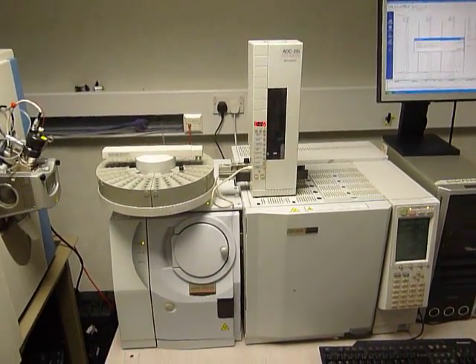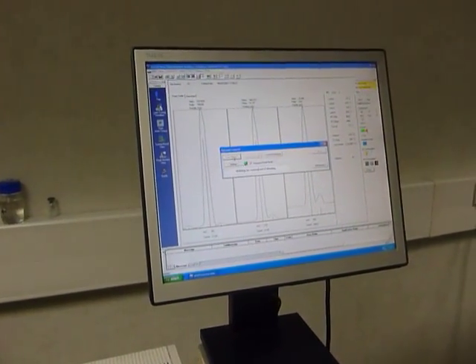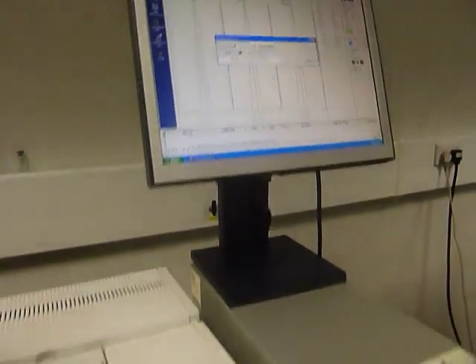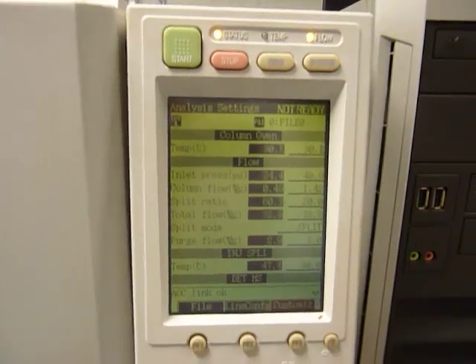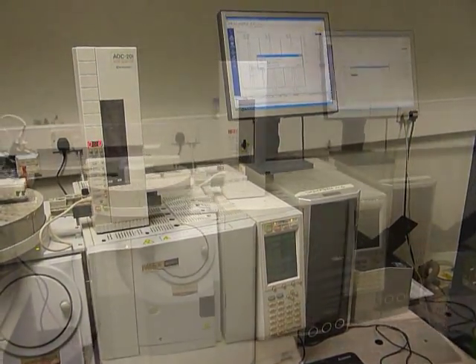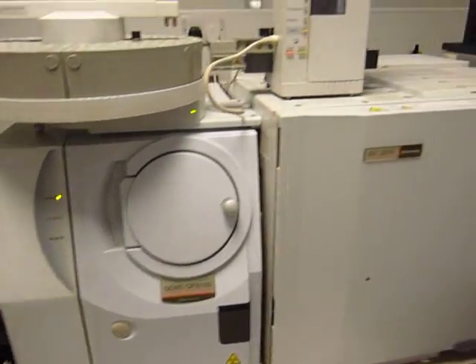At the moment, the pumps are all off and the vacuum system's all off. You can see there that the vacuum is in the red reading because the pumps are set up. Very simple to set going — you just press the auto start up, waiting for the carrier gas to flow into it. You can see down here that the inlet pressure is rising as the hydrogen gas is being taken into the system. You can now hear the turbo pump within the mass spectrometer starting up. It sounds like a jet engine winding up, and you can see it's now starting to go into the green vacuum area of the software.